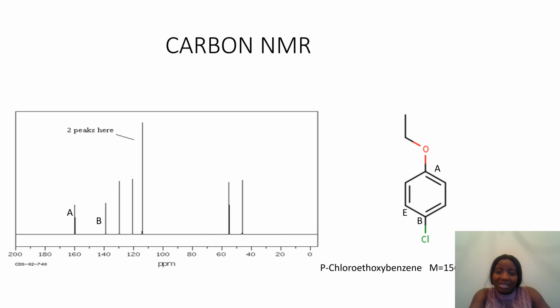Also, what we can see is those two carbons are the carbons that have less hydrogen. So usually when a carbon has less hydrogen, it is more downfield. So now it was time to decide among these two and these two where was the position.